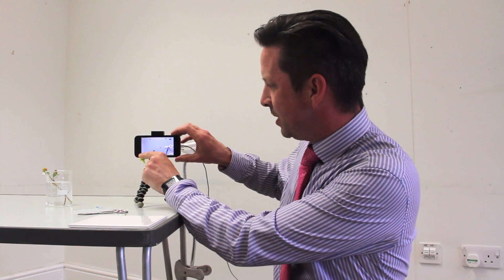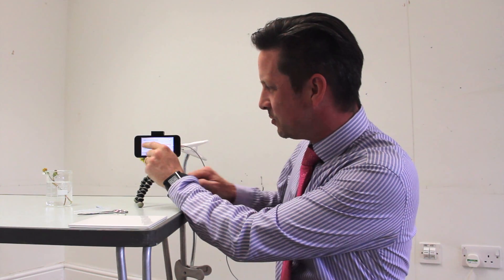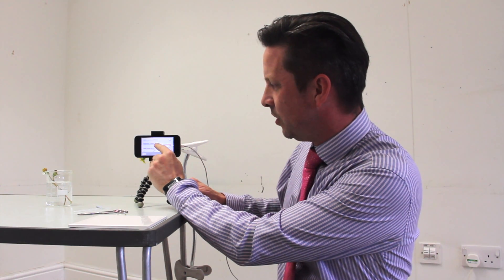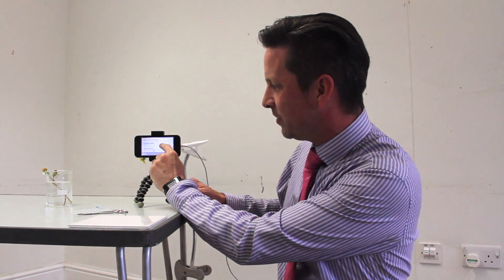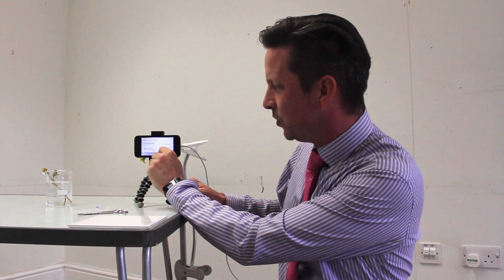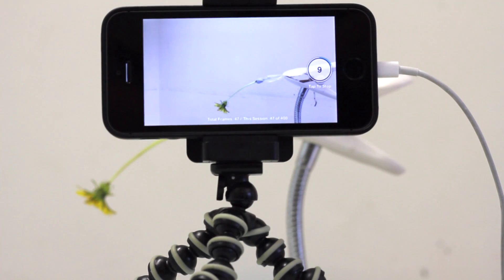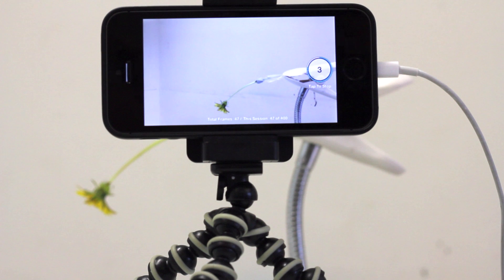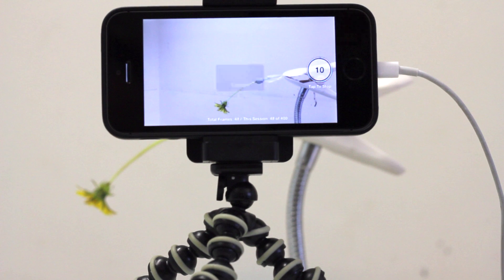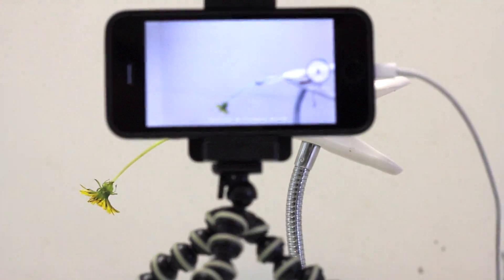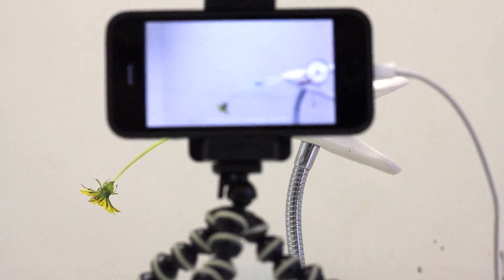and you do that by setting up the options on the Framagraph app to record a frame every 10 seconds. We'll set the number of frames to about 400 frames, which gives us just over an hour's worth of filming, and then we'll start the filming. Hopefully over the course of the lesson we should see this dandelion stem change its orientation.